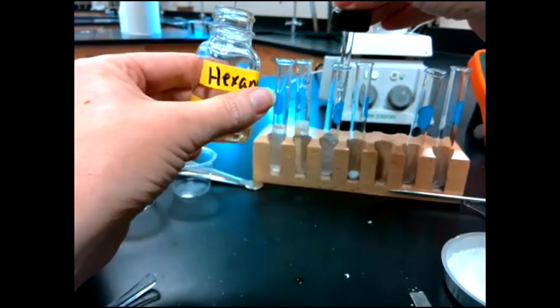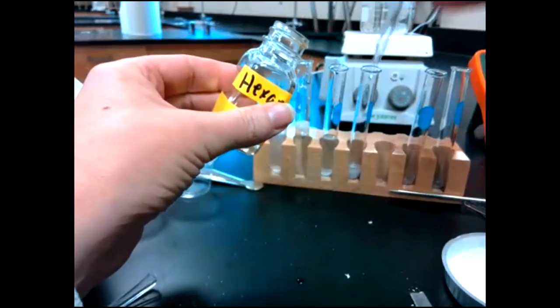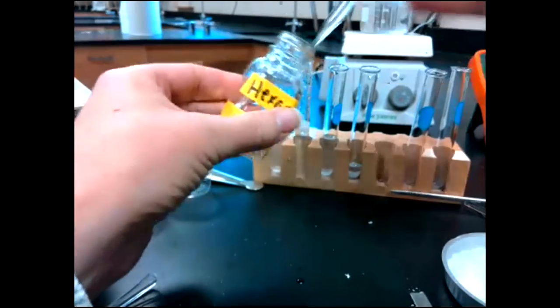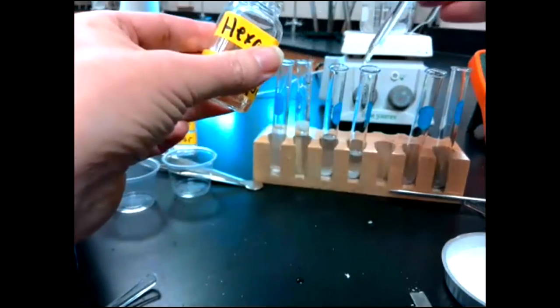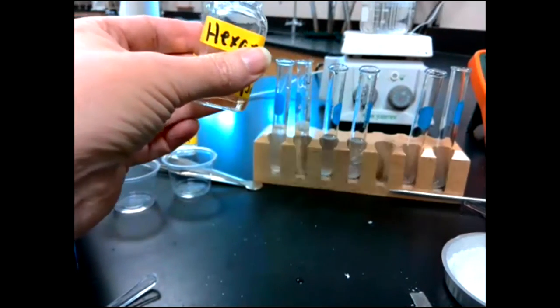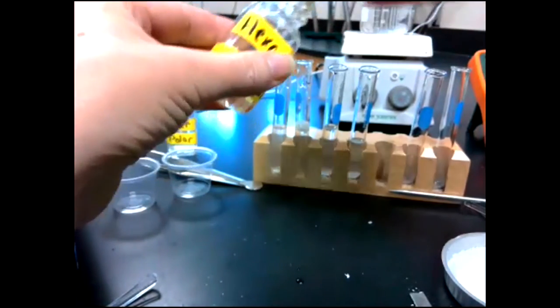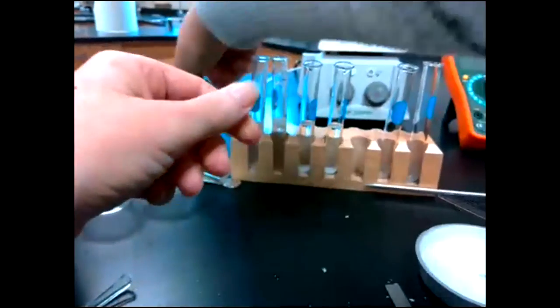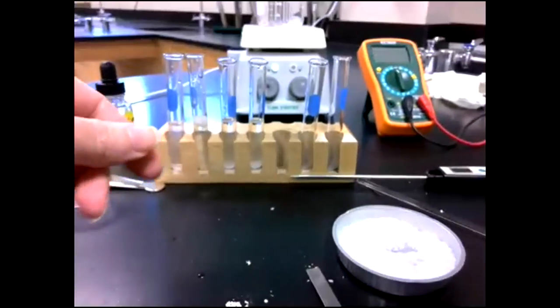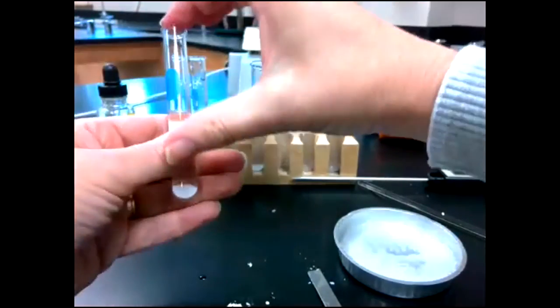I want to fill it about halfway. Run out of stuff. And this smells like gasoline, so it smells, well, it smells like a lab to me, but do a little bit more in each. Okay, so A in hexane, and now I'm going to shake this up again.